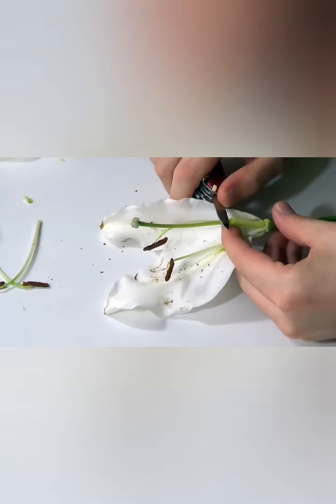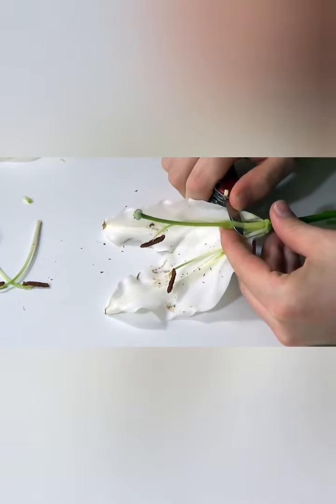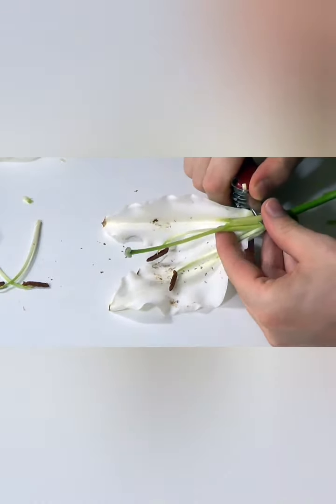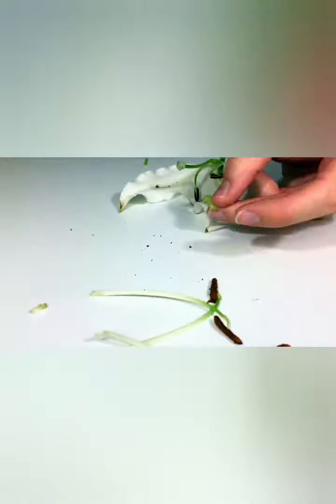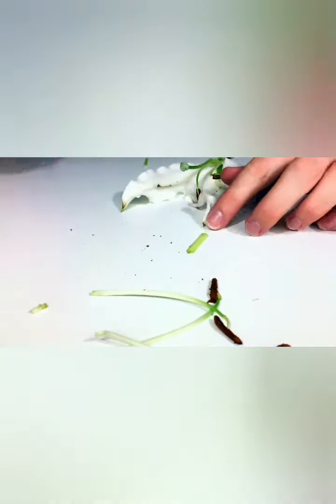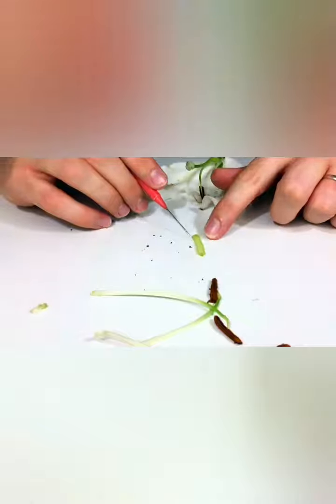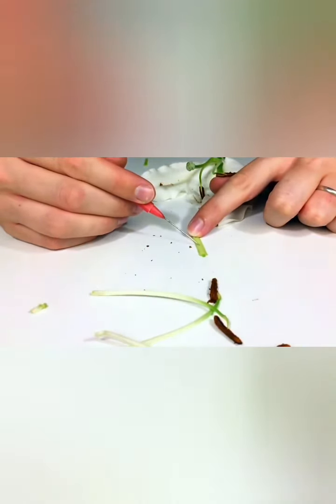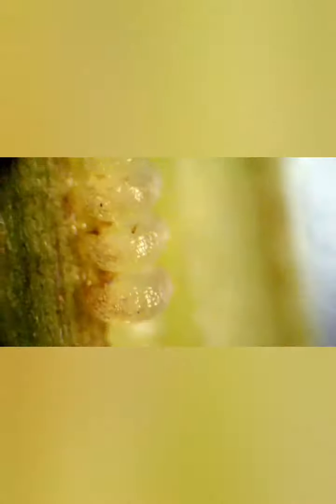We've cut off the outer layer, and now we'll cut off a little section of it so that we can have a closer look. On the inside of the ovary we've got lots and lots and lots of these absolutely tiny little ovules. We really need to see them under a microscope to get a good view of them.